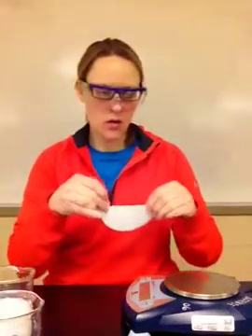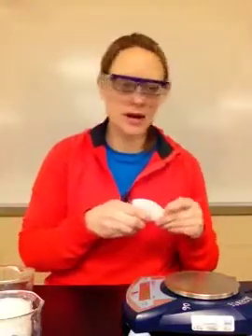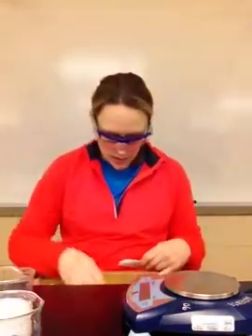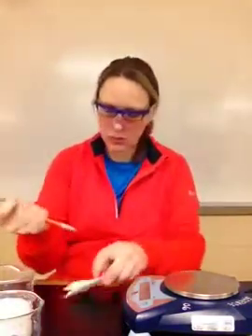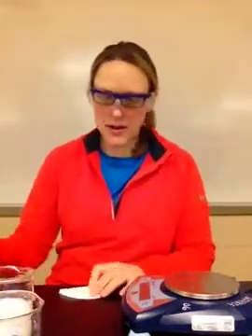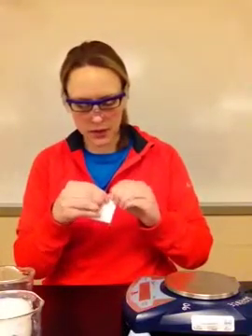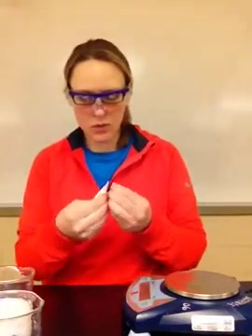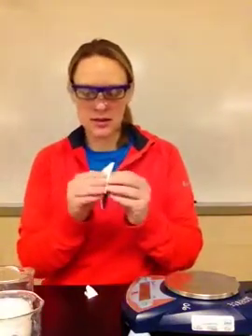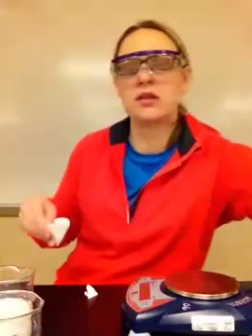Okay? So I'm going to fold it just like I did. Make sure you put your name on it in pencil. Okay, so make sure you put your name with pencil. Okay, and again, some of you asked, well, why did we tear the corner before? All right, well, we want this to stick to this funnel.